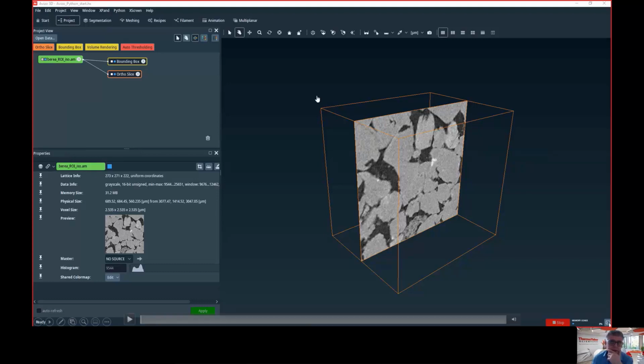For example, you want to do a segmentation in Python. You know some algorithm for microCT that you think is the best one. So what you will need is to be able to collect the matrix of grayscale values that is inside this microCT, put it into a NumPy array, then start your workflow in NumPy, in scikit, whatever you want to use. And when it's finished, you want to put it back into an object that is a segmentation of Avizo. That's a very common usage.